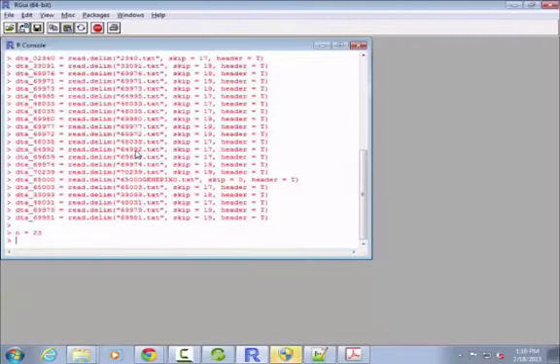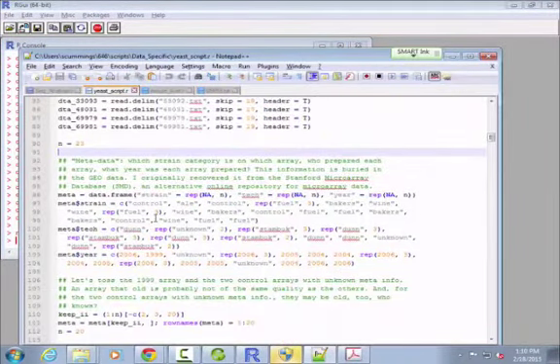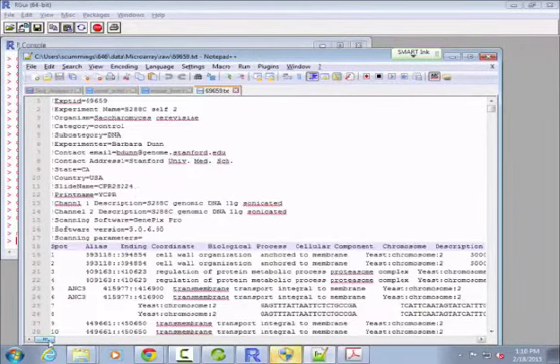Okay, so I've read in all these files. Each one of these files corresponds to a microarray. And then here's what we said we know about these data. If you were to go through the metadata in each of these text files, you would see things about, like I said, who ran the array and what strain of yeast was on this array.